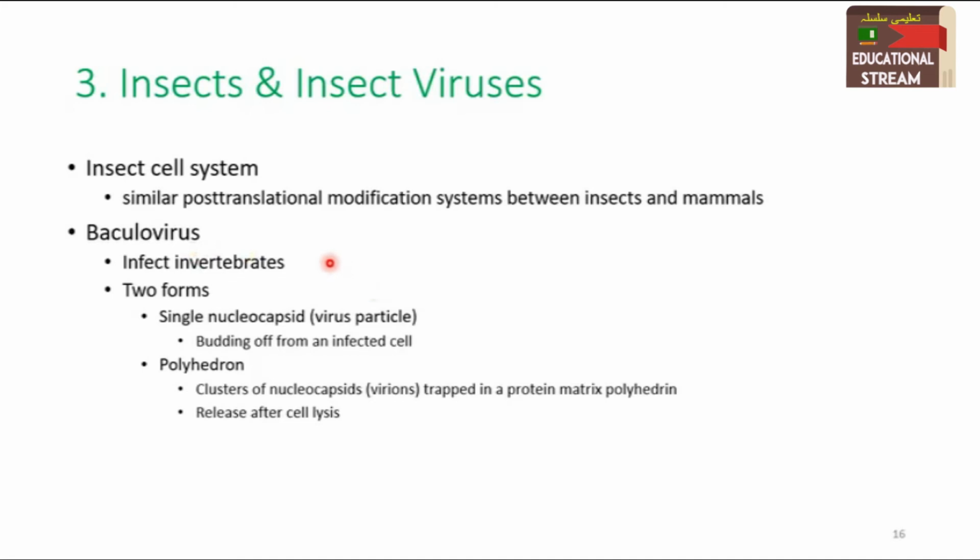When they infect their insect larval host, they act as a parasite and they kill the larvae, turning them into factories for virus production. Late in the infection process, the virus produces a large amount of two proteins, P10 protein and polyhedrin protein, neither of which is required for virus production in cultured insect cells.